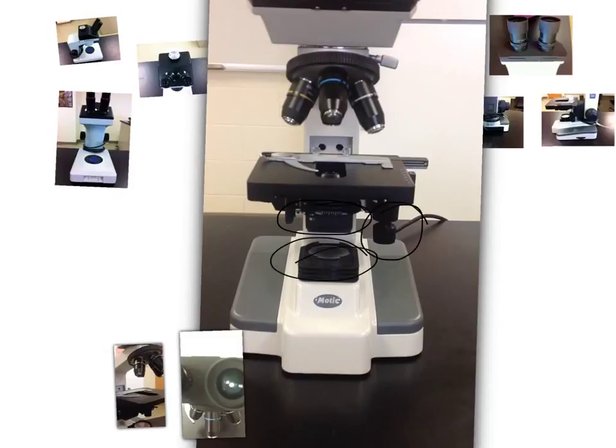This here is very important. This is going to move your stage back and forth and left and right. Another piece that's quite interesting, as I've got to point out before, this right here. This moves your light source up and down so that you don't want to have it hitting the bottom of your slide. Also, if you want to dim the amount of light that's hitting your slide, you can also move it down.